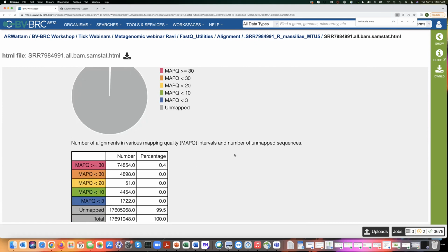There's a question from Tomaska and Samuel. He's asking, how sure can you be that Staph didn't belong there? Oh, because I tried to map the reads to it. It didn't map to anything. So I tried to drag everything out from it. That's why I'm convinced it wasn't there, because I tried mapping to Staph itself and I couldn't find them. Okay, good. That's how I feel convinced of it.